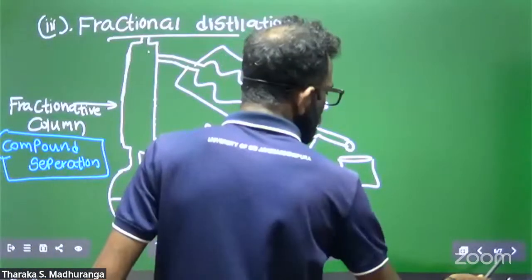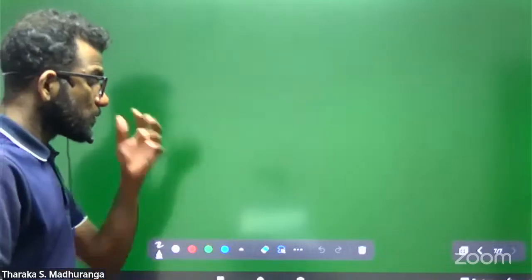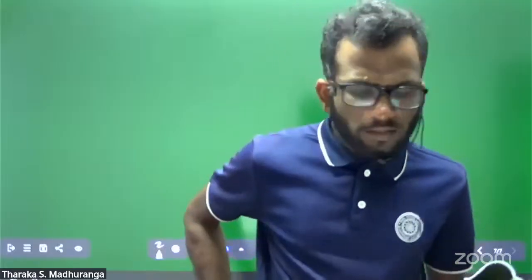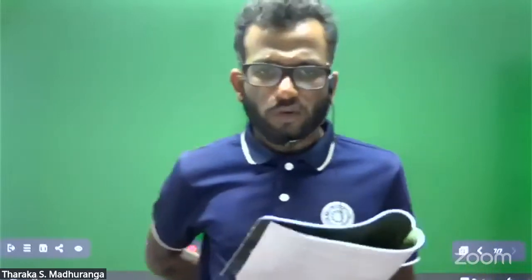Now come to the separation and identification process, page number 11. Purification of the pure product from the fruit extract separated from plant parts. Chromatography is the method used for separation. For separation and identification both, we use chromatography.